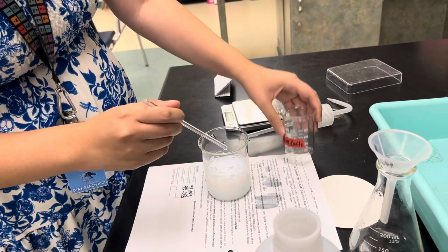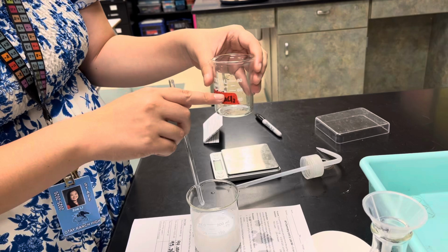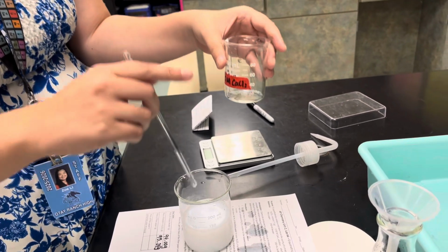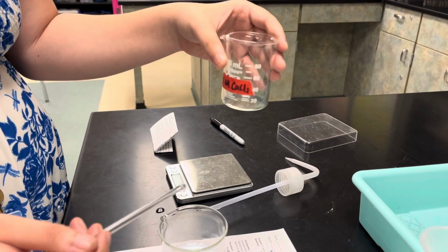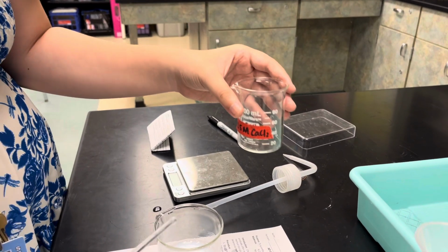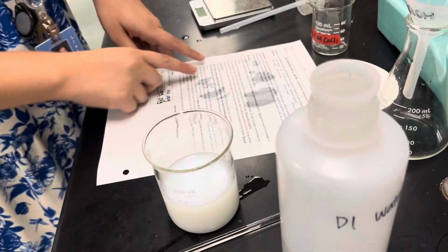So you might also be wondering, why was I able to just add a random amount of this and be okay? It's because this is an excess. Remember, we had limiting reactant and excess reactant. Because we had this as an excess reactant, it doesn't really matter that we had a little bit too much, as long as we fully reacted all of our original mystery crystals. All right, so now we have our cloudy solution, and so we're going to go to step number 5.